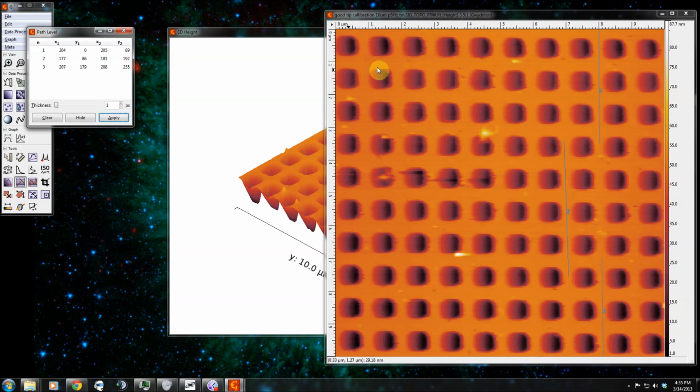And anything that's perfectly horizontal or perfectly vertical, you got to be wary of. There's a good chance that that's an artifact. And in this particular case, there was a little dimple right here that it leveled off that it wasn't supposed to, and so as a result, all this data to the left and right was raised up too high. So I'm going to drag this line back up here, above where this started. I'm going to start another one over here. Again, careful not to hit any bumps or divots and trying to align these.